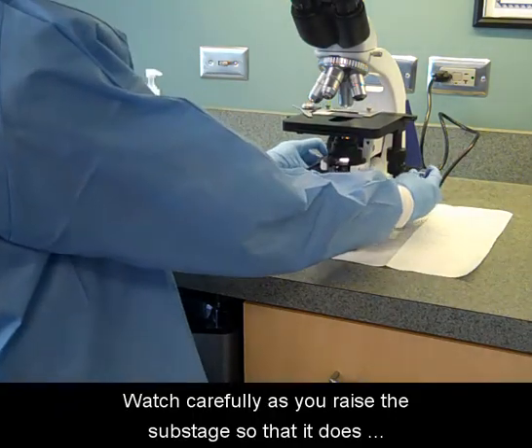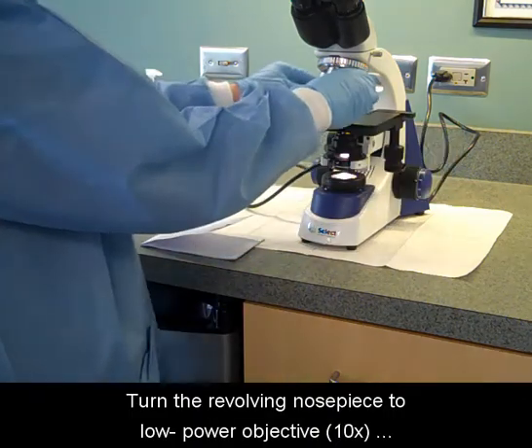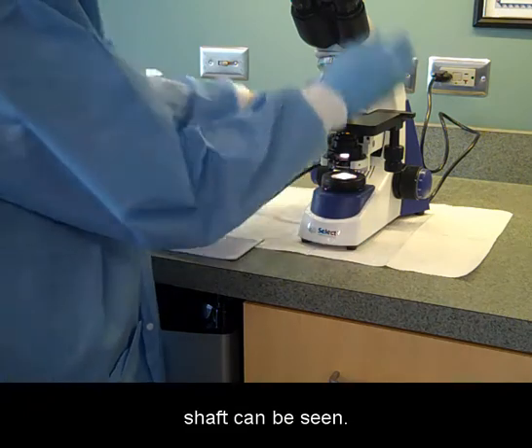Watch carefully as you raise the sub-stage so that it does not come in direct contact with the slide. Turn the revolving nose piece to low power objective, 10x, and begin to focus the coarse adjustment dial until a wide shaft can be seen.